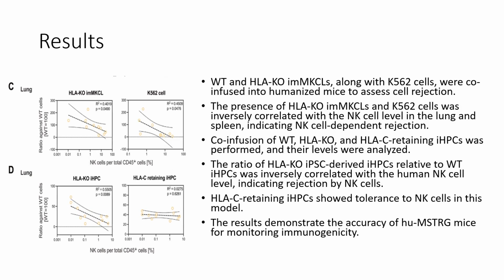So in figure C and D, it's demonstrated that WT and HLA-KO imMKCL along with K562 cells were co-infused into humanized mice to assess cell rejection.